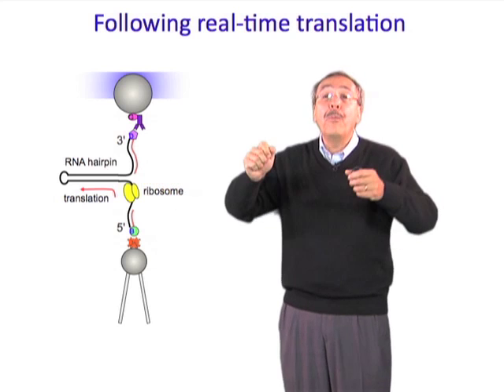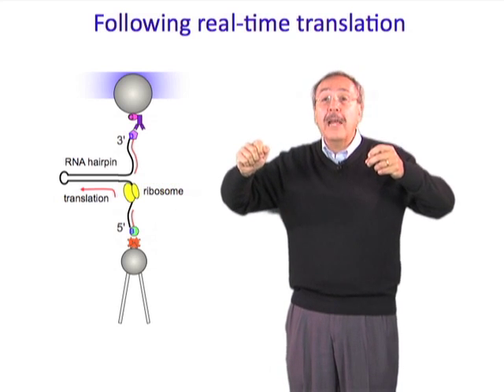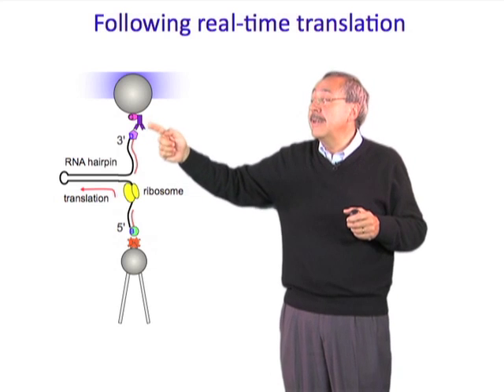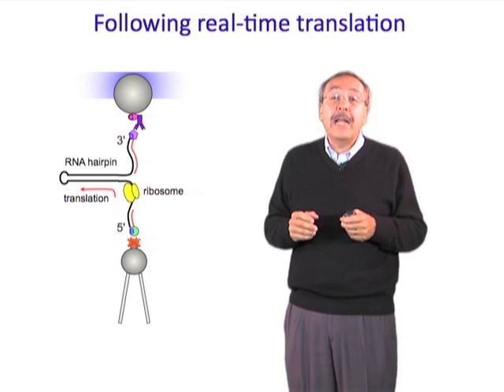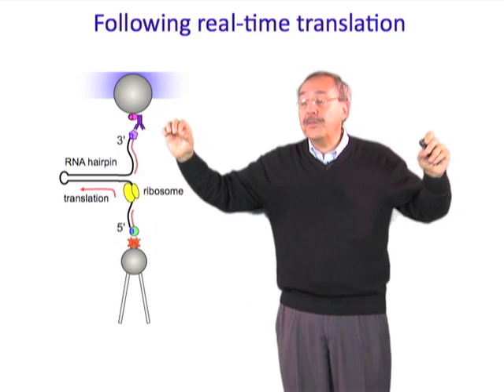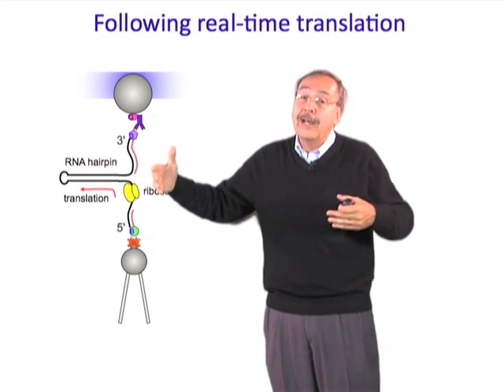And as the hairpin opens and is being translated, essentially the arms of the RNA molecule are getting longer and longer, which means that the bead distance actually gets separated, right? So we can actually follow the reaction, in this case, by the beads moving apart as a function of time as the ribosome actually enters the hairpin and opens the hairpin.